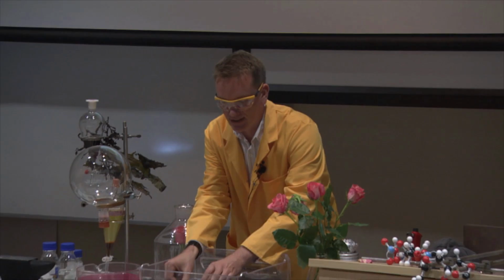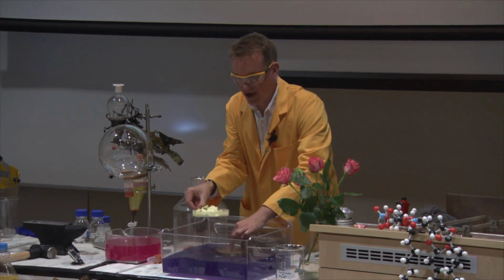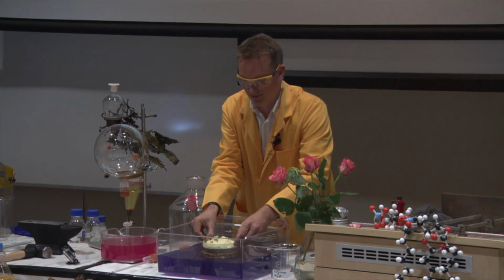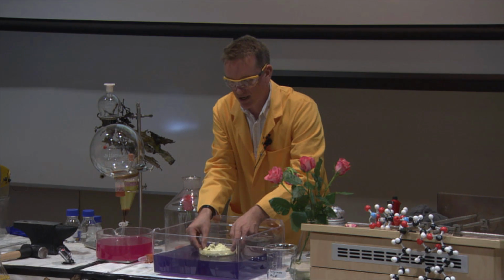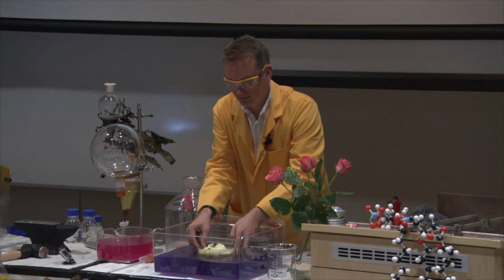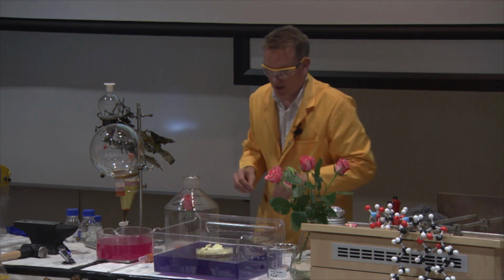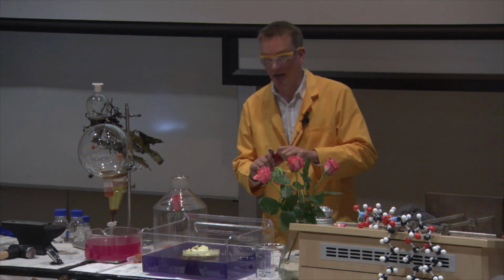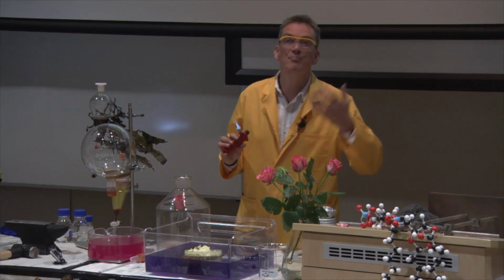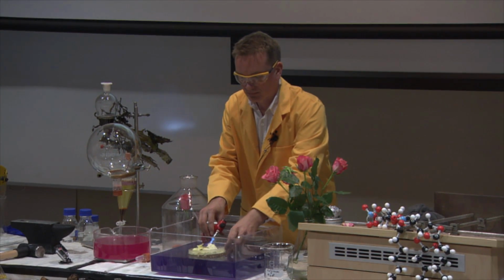Oops, it's just gone a little bit. Let's try it that way. So this is some sulfur here. I'm not going to set fire to my nice piece down the front there because the person who lent it to me might be upset. I'm going to see if I can set fire to this here. Ooh, if I can get it to float on there. Right, and that's steady. So there it is, just floating away. And now I'm going to just apply a light and see if we can get it to burn. After all, the name brimstone means burning stone. So let's see if we can get it to burn.